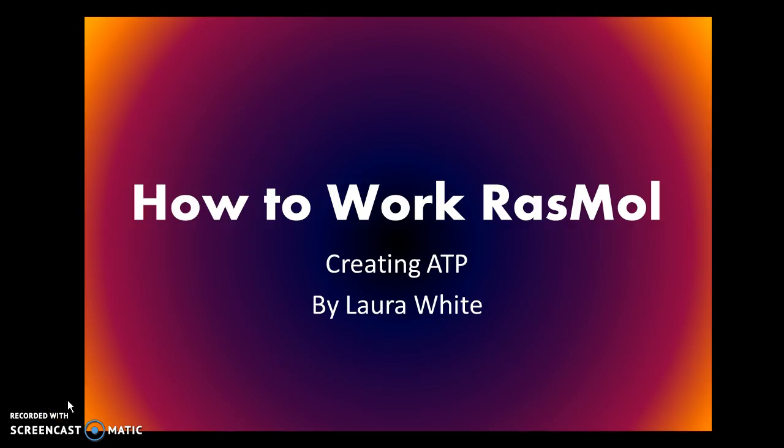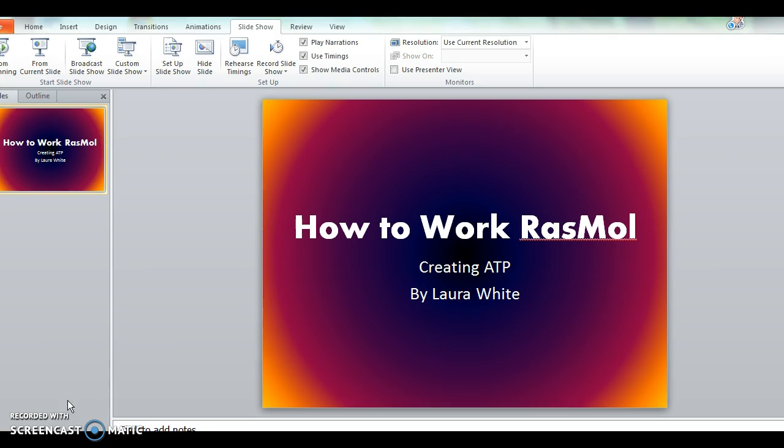Howdy! Today I'm going to show you how to work RasMol, and my example will be using an ATP molecule, also known as adenosine triphosphate.